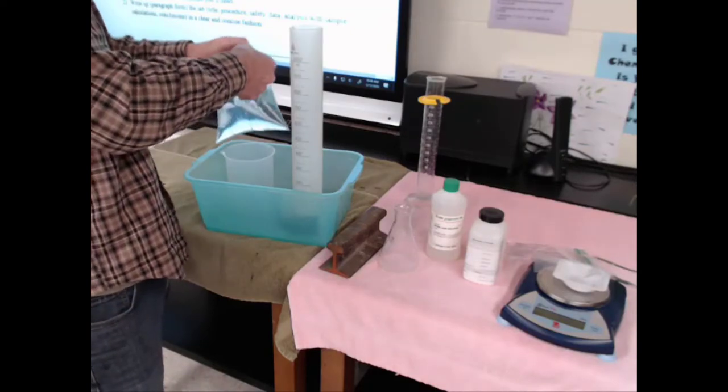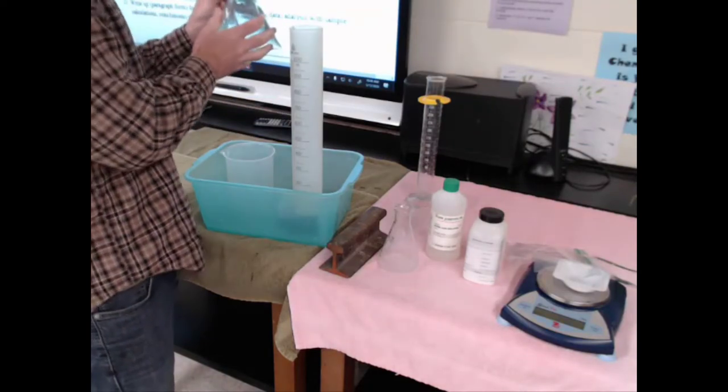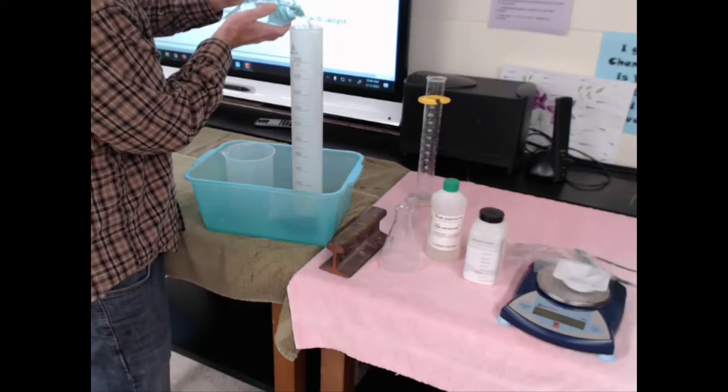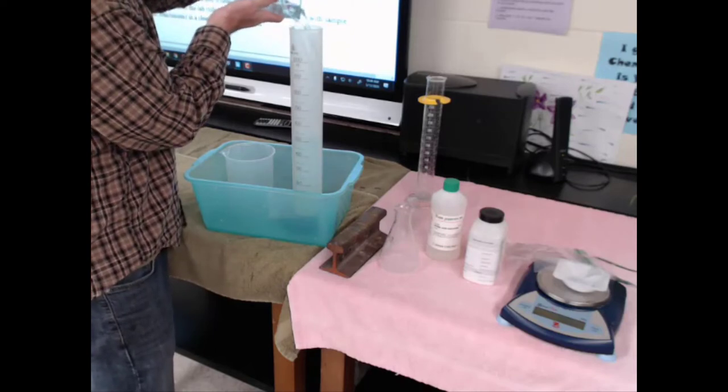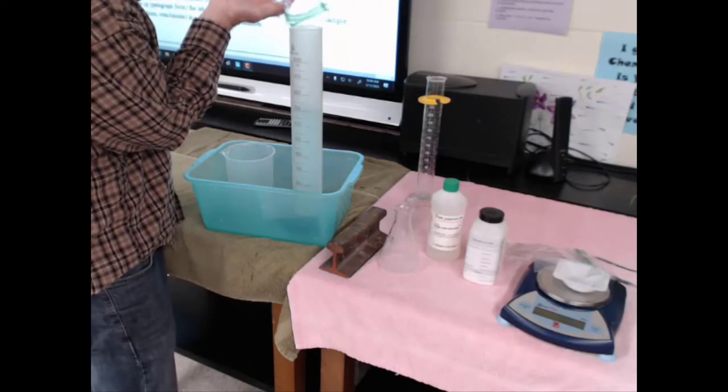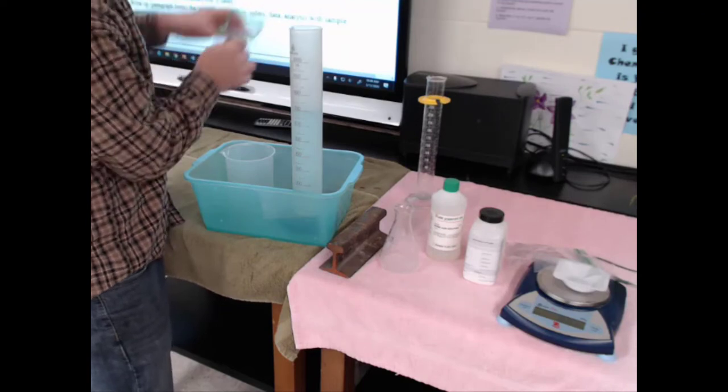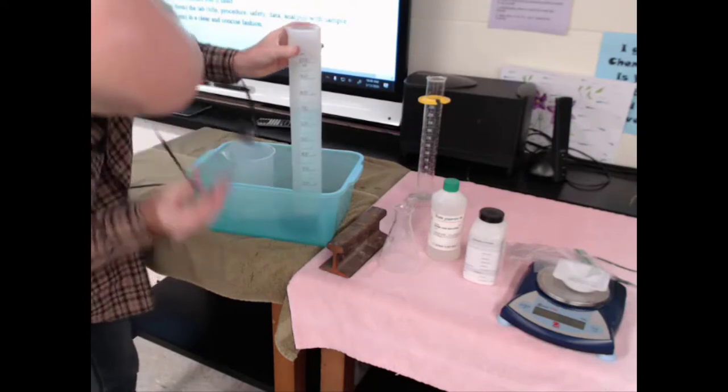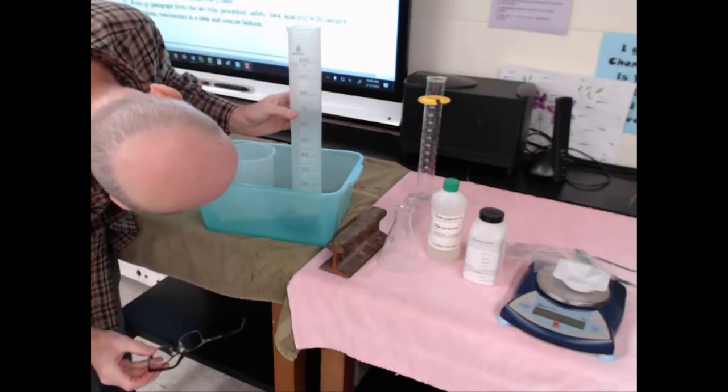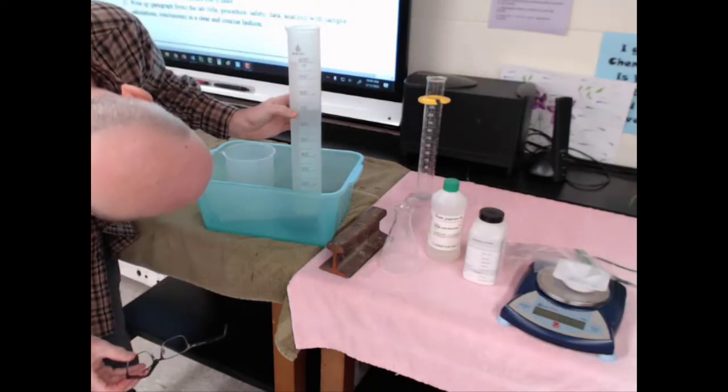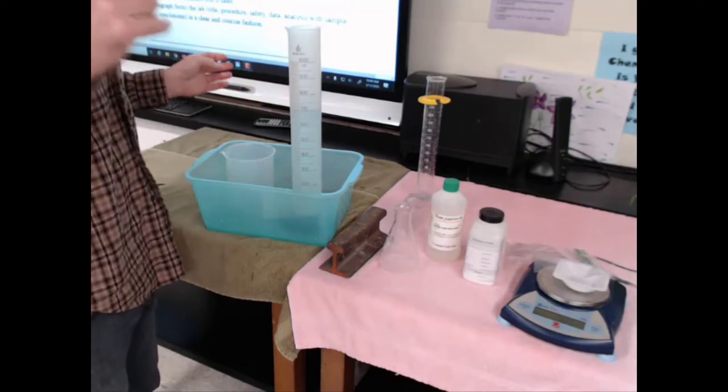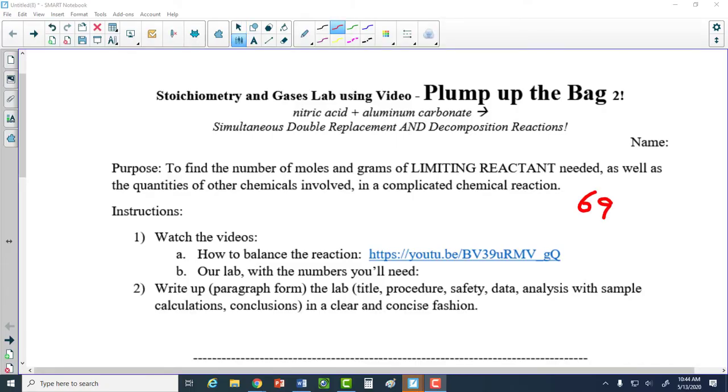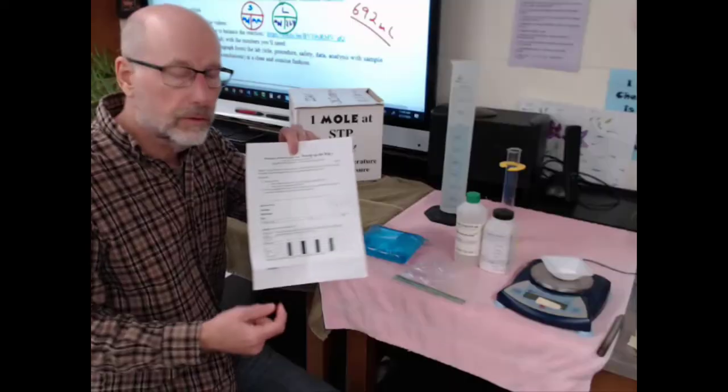Now I'm going to pour the water into the graduated cylinder without spilling a drop, and we'll see how much water was in there. That's how big the bag should be. It's about 690 - let me see, bottom of the meniscus: 692 milliliters. Write that down. 692 milliliters is how big the bag is.